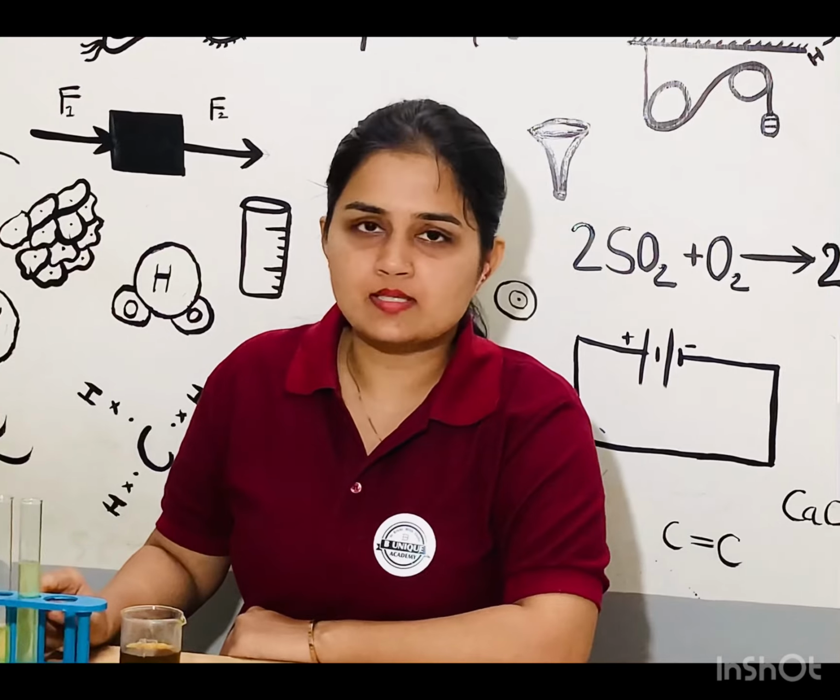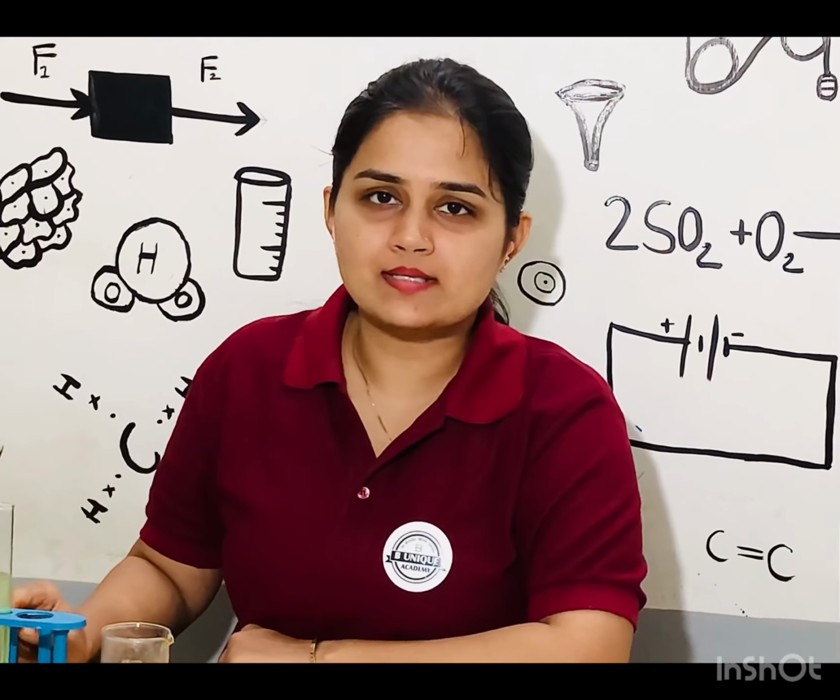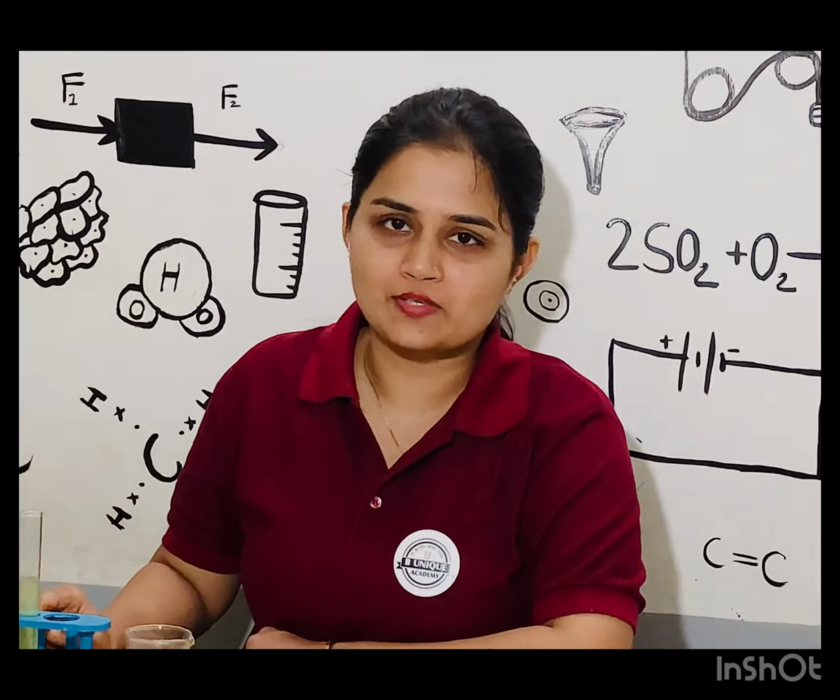Thus, by this activity we can prove two things, that particles of matter are minute. Also, particles of matter can diffuse with each other.